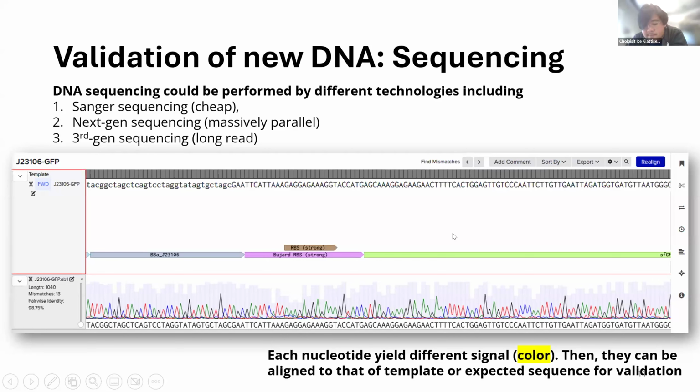When you open this information in a DNA reading program, you'll be able to compare whether the actual DNA you have matches the DNA you are trying to make. That's a very important process. When we make any DNA in the lab, the important thing is to make sure that it matches what we are trying to get. If there is any missing information, a missing base, it can turn our DNA into something that's not usable anymore. Those could be called mutations or deletions in this DNA.